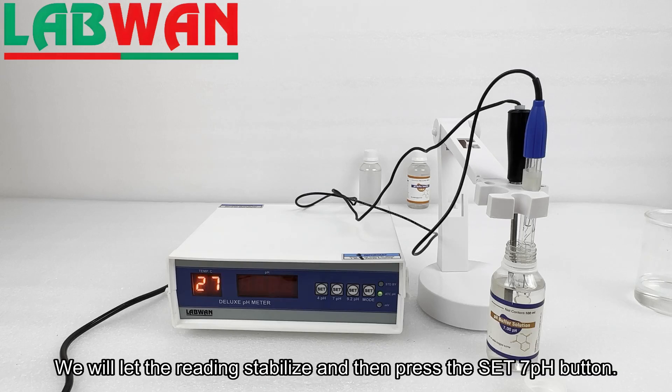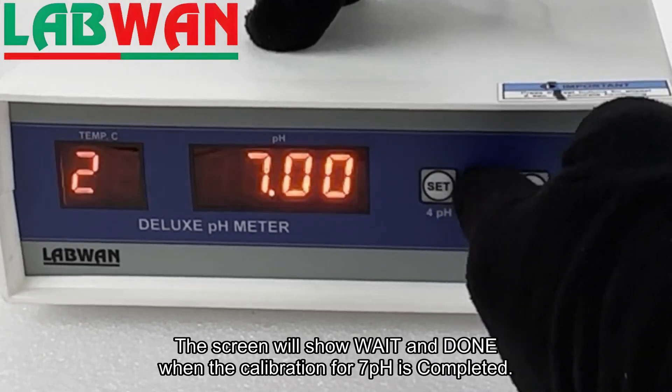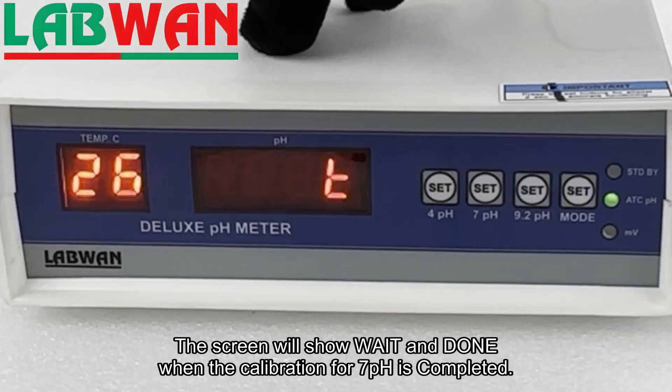We will let the reading stabilize and then press the Set 7 pH button. The screen will show 'wait' and then 'done' when the calibration for pH 7 is completed.